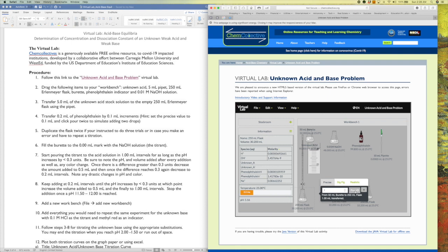And the increments are still fairly small. That was 0.04, right? Still going up by 0.04, so 1 ml is still good. That was by 0.04. It went up by 0.05.